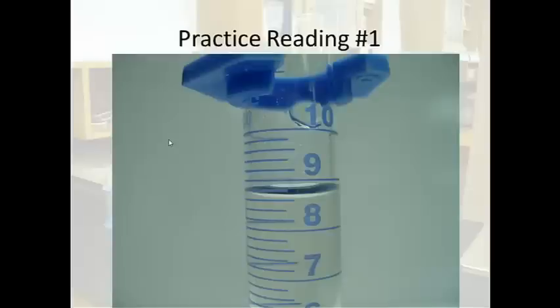Here's some practice. See if you can figure out what the precise reading should be for this graduated cylinder.